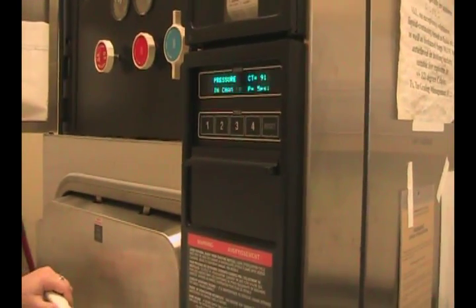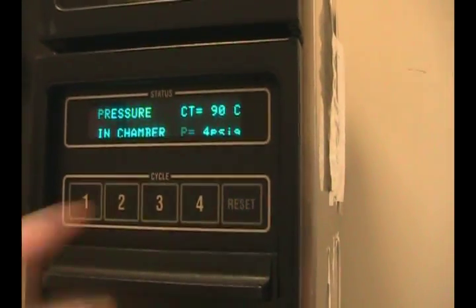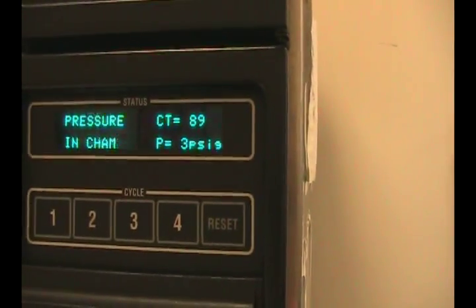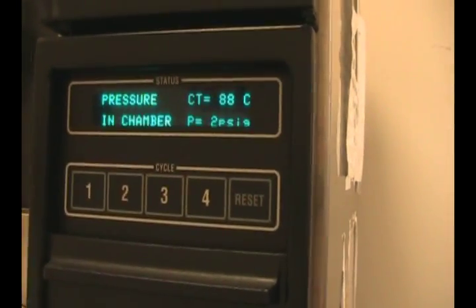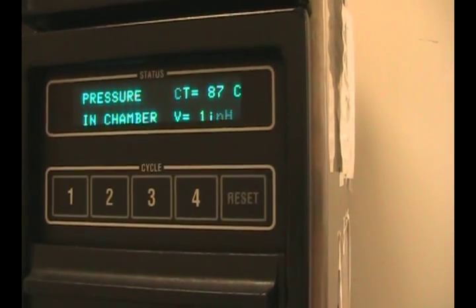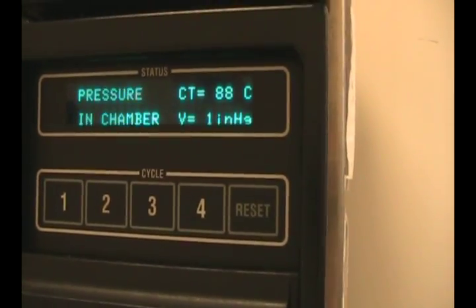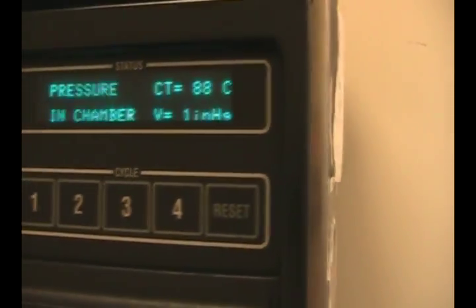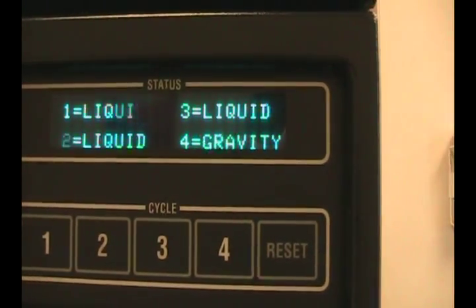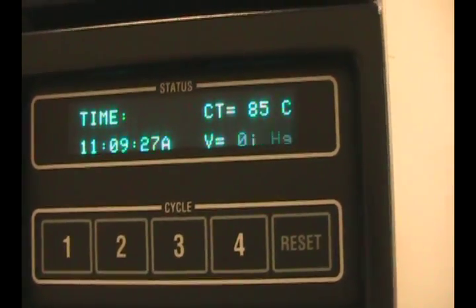If you ever choose the wrong cycle, you can press the reset button to cancel your cycle and the pressure in the chamber will come back down. Right now you can see it's at 4, 3 psi. Now it's venting the heat. It went down to zero — V equals zero — and now the cycle is back to where you can choose how you'd like to run it again.